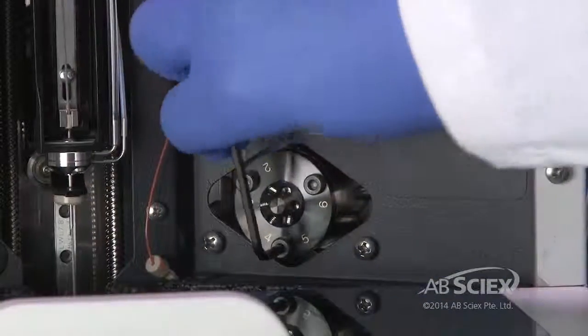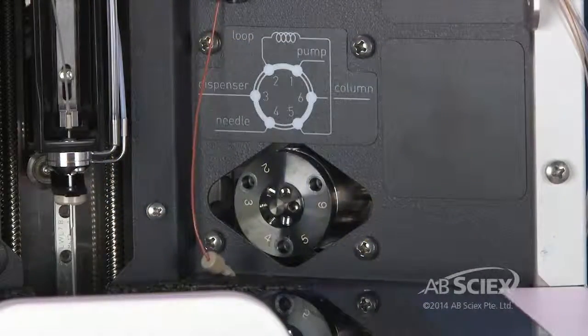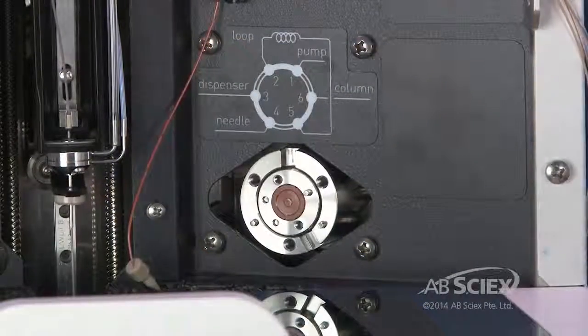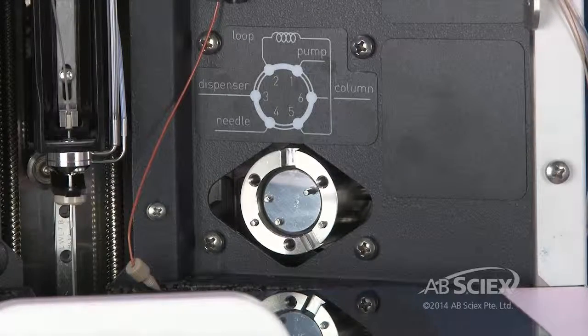Using a 3 mm hex wrench, remove the three stator bolts. Carefully remove the stator from the valve body. Carefully remove the rotor seal from the valve body.